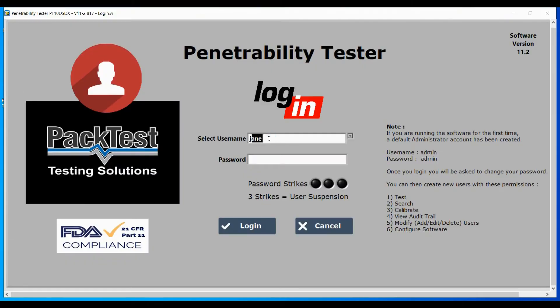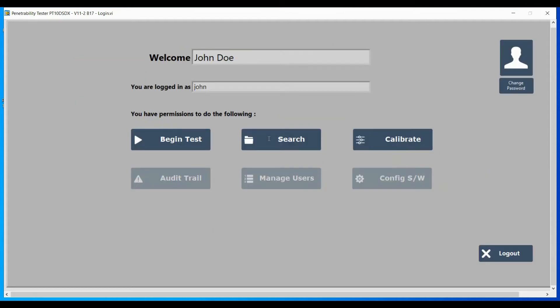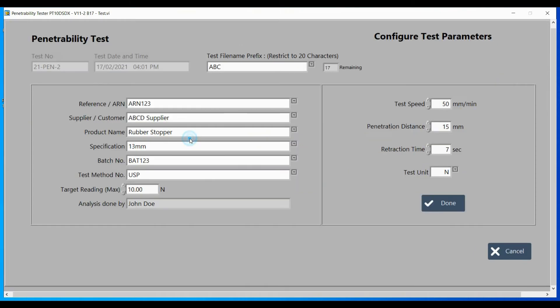Open the test software and log in with your credentials. Click on begin test, and then fill in the necessary information.